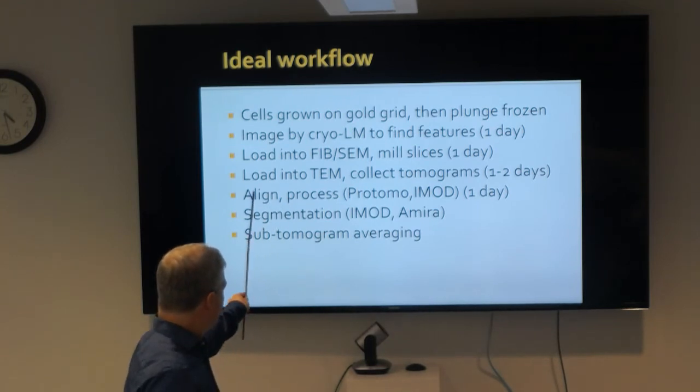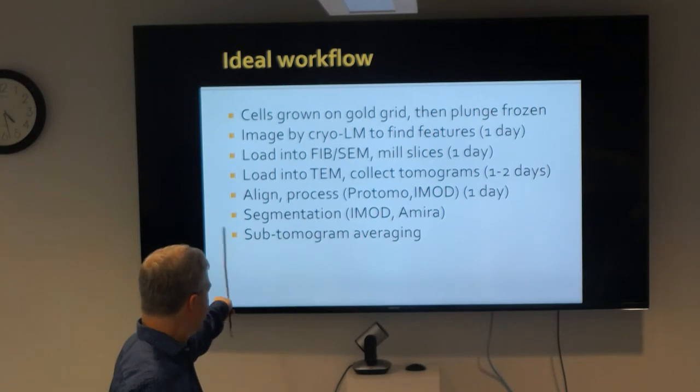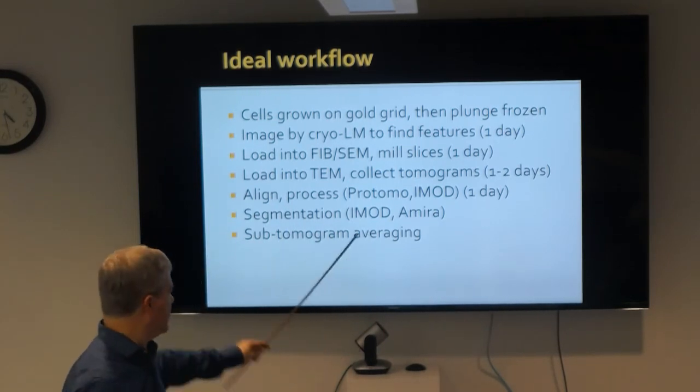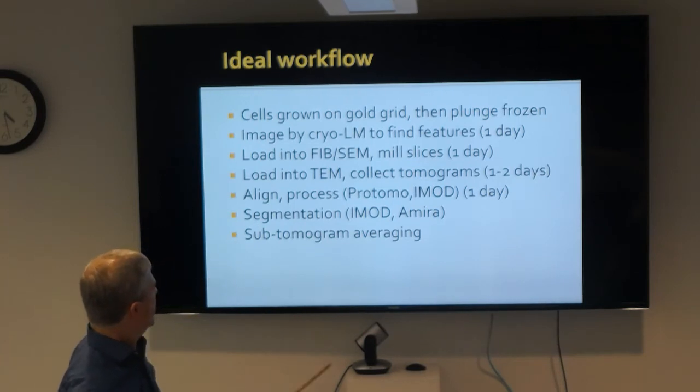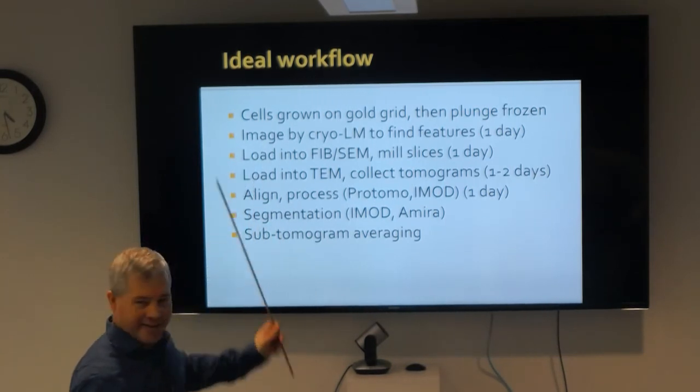Align and process them using the Protomo or IMOD. Takes a day, and then again you do have to do the segmentation or subtomogram averaging. This will be the long step. Although, to be honest, all of these steps are sort of hard.